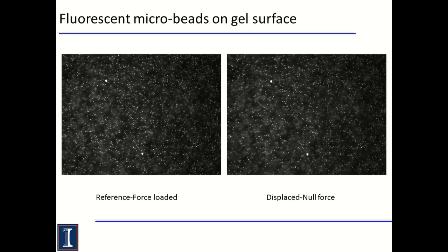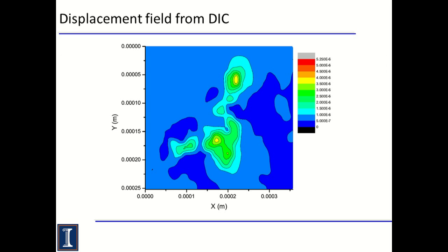The displacement of the subset on the image before deformation is found in the image after deformation by searching the area of same light intensity distribution with the subset. Once the location of this subset in the deformed image is found, the displacement of this subset can be determined. Several functions exist to match the subset from one image to another. Here we can see the displacement field obtained after digital image correlation of the bead images.